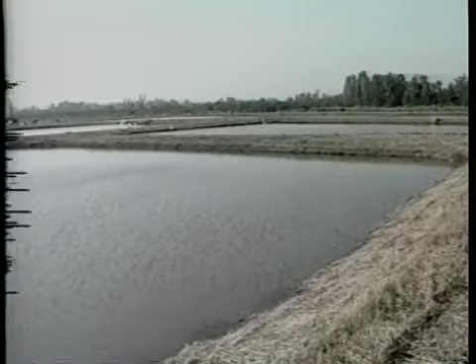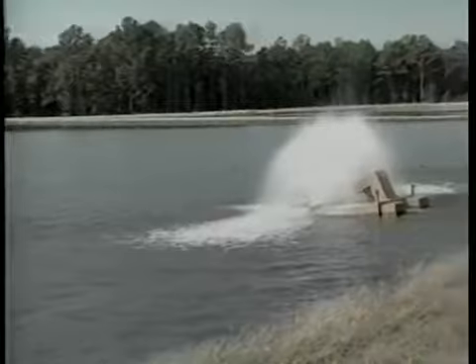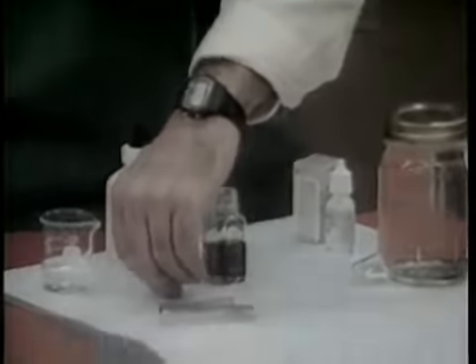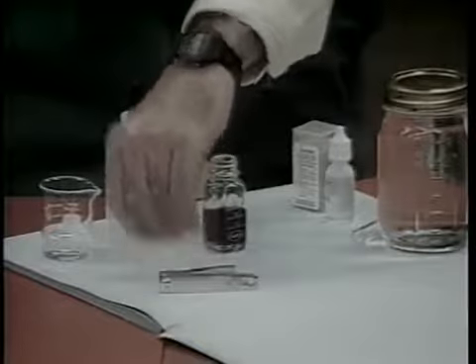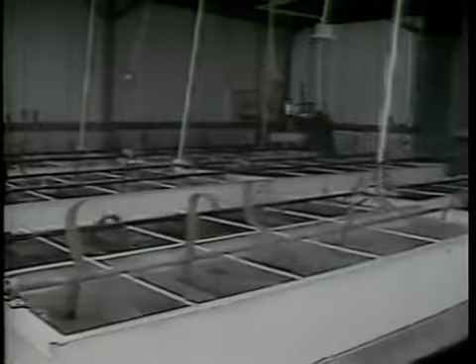This tape is to show the types of water sources available to pond owners, how these water sources differ in quality with respect to type and location, and to describe the basic ionic constituents present in each source. A discussion on dissolved gases, plankton, aquatic plants, turbidity, and pollutants is also included. Testing procedures for several basic water quality parameters will be presented and possible corrective measures will be discussed. In addition, special considerations regarding flow-through systems will also be included.